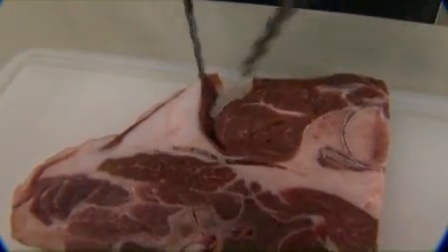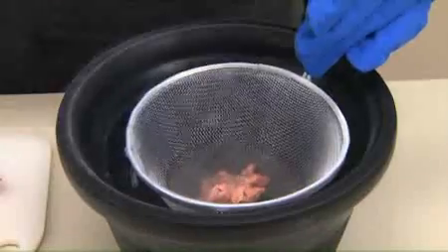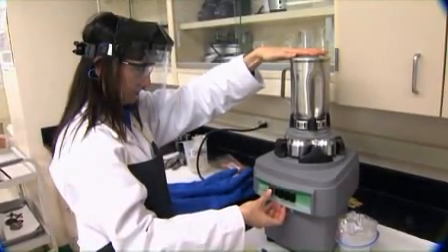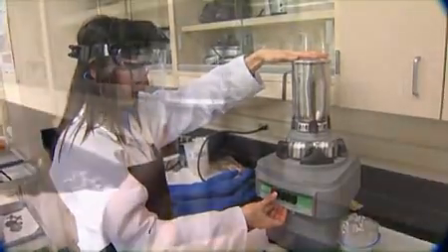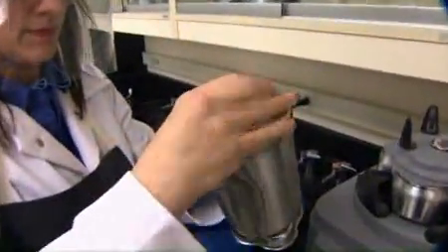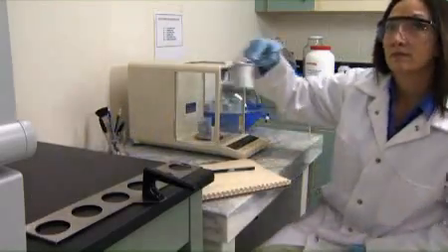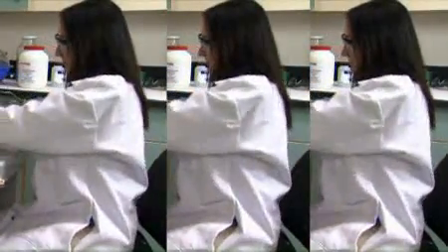Before a sample is analyzed, it must be properly prepared so that an accurate test result can be obtained. This is achieved by homogenizing the sample, which ensures that all sample material will be of consistent content throughout and suitable for analysis. For details, please refer to Preparation of Test Samples, Analytical Services Method Number One. It is recommended that all samples be analyzed in duplicate or triplicate for accuracy and statistical analysis.